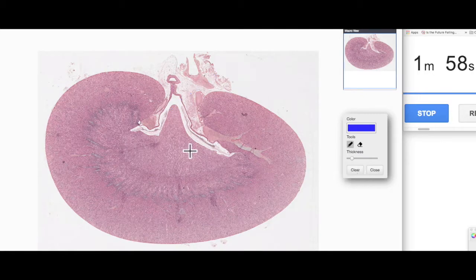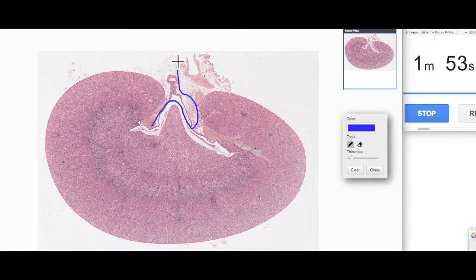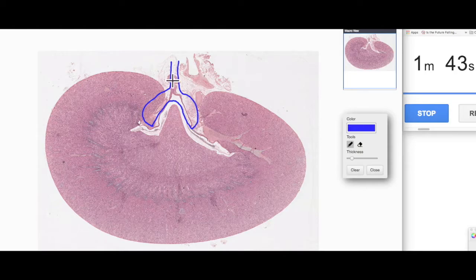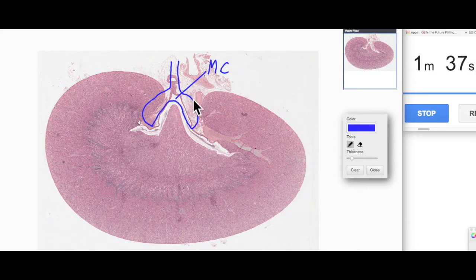Now, collecting that urine is a little cup-like structure referred to as a minor calyx. It looks like a little cup. It's the first region of the urinary system that's lined by urinary epithelium or urothelium. This is the minor calyx draining a lobe of the kidney.